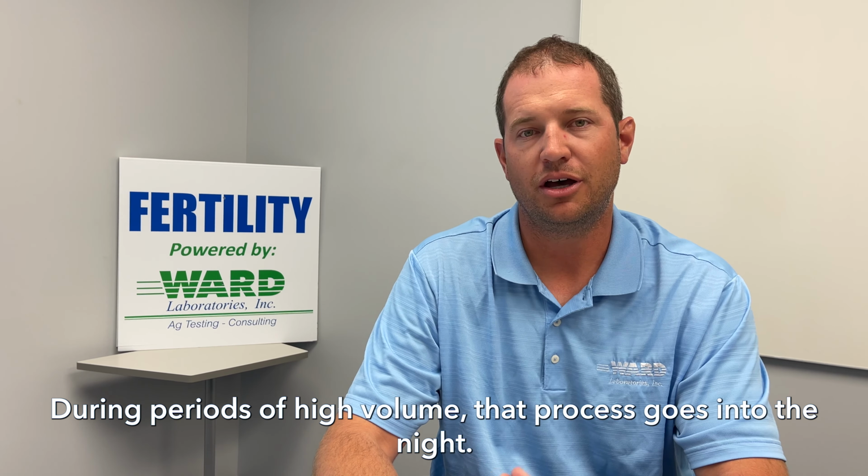Now, when we get to periods of high volume, that goes into the night. So we'll start the review process maybe in the evening, likely the start of day three, which is now Thursday morning on our theoretical time frame here. We're reviewing all the information. When I say reviewing the information, that's myself or Ray, Patrick here at the lab. Some trained soil scientist is looking at all the different parameters together to make sure that report makes sense.